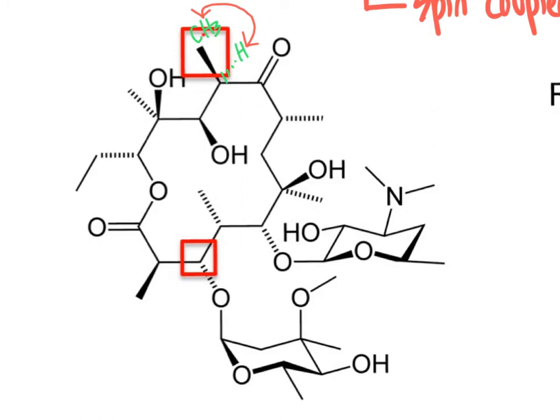As we come from the proton here, this would be our only vicinal position. In some cases, you may also see a correlation over to here, to the proton that we bonded right here, as a weaker COSY correlation. But the main thing that we observe is these correlations to vicinal positions. So I'm going to leave that like so.